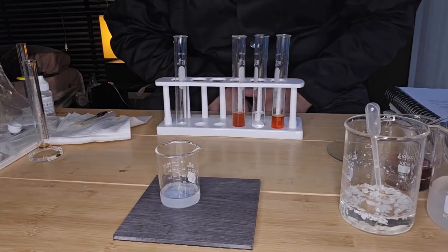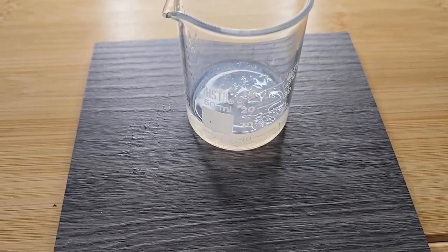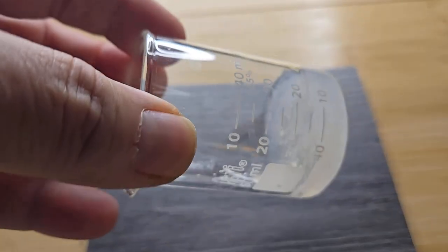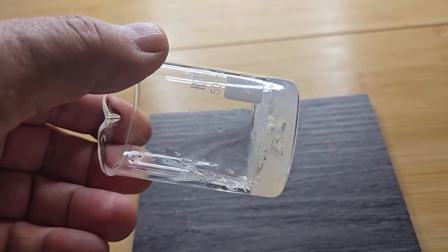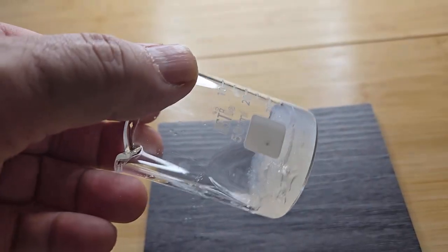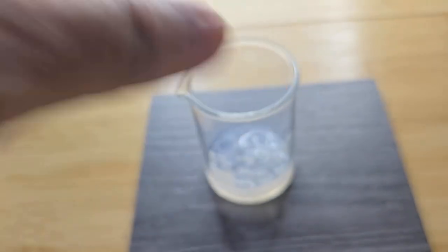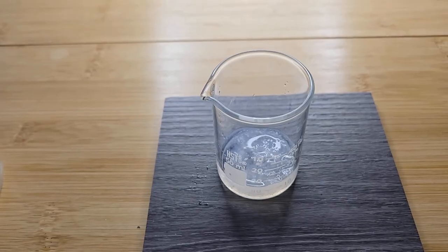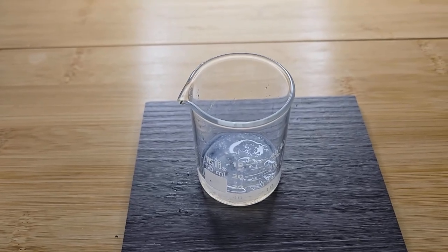So it immediately has solidified. It has solidified into a jelly-like gel, as you can see. There's still some residual alcohol on there. But I'm going to wait and let that alcohol evaporate off. And then I'm going to put the gel onto a watch glass and light it with a splint, demonstrating the canned heat capability of this gel.